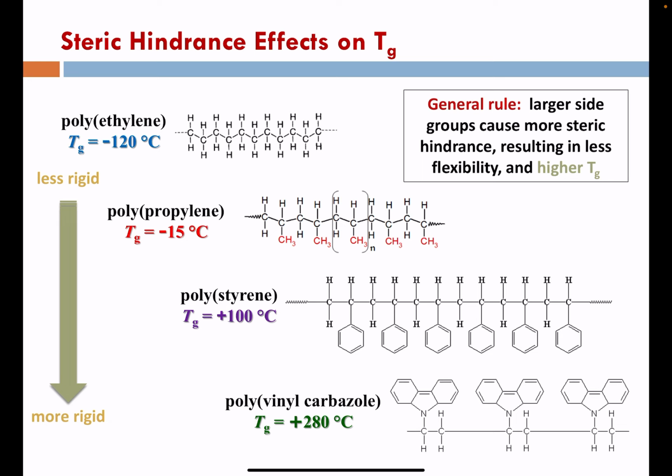Okay, to touch on the steric influence that we just mentioned, here's another example. Here's polyethylene, showing about 5 repeat units here. And we show and report the glass transition for this material as negative 120 degrees C. By swapping out side chains from the smallest atom on the periodic table to one of the smallest carbon units that we can consider, we can see the implications on Tg.